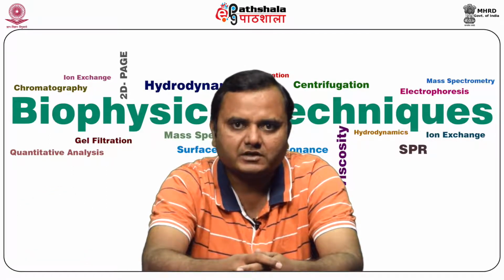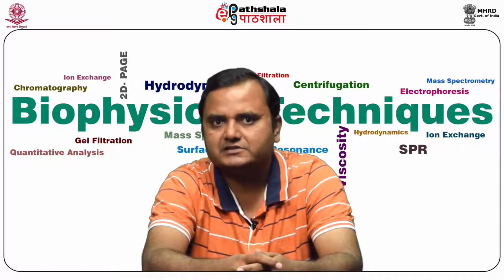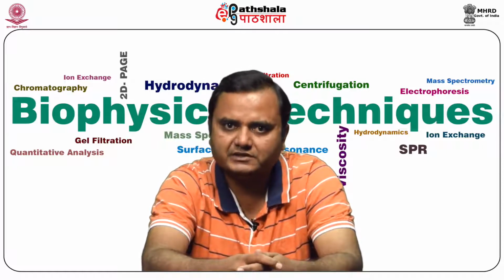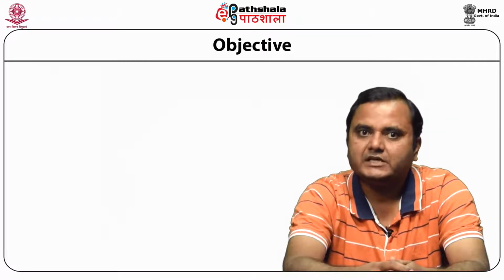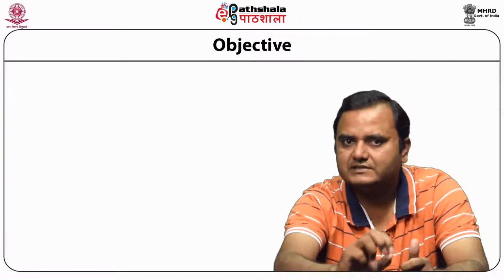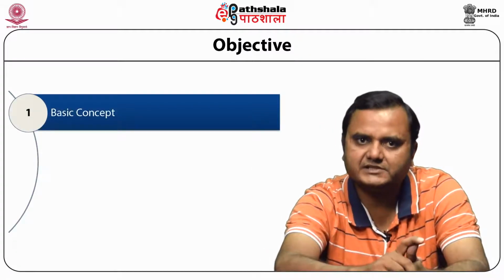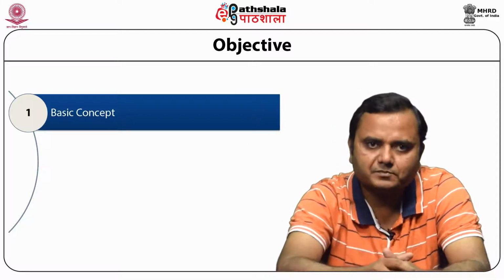Today I am going to talk about the module differential centrifugation and density gradient centrifugation from the paper centrifugation techniques. In this module, we are going to discuss the following things in detail. First is the basic concept of differential centrifugation, and how it differs from the normal centrifugation process.